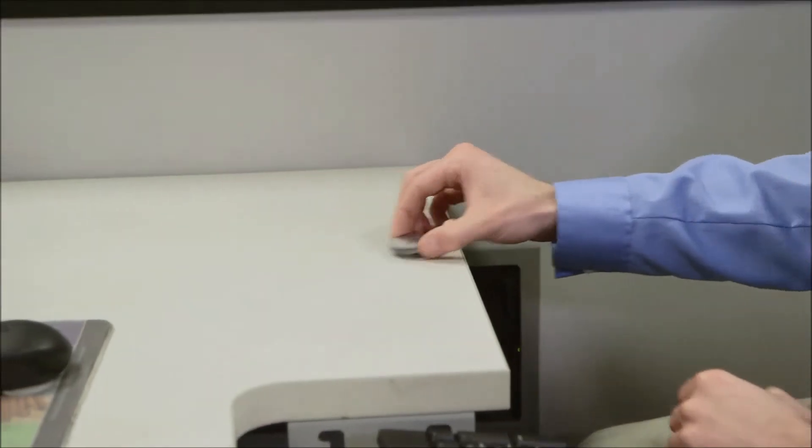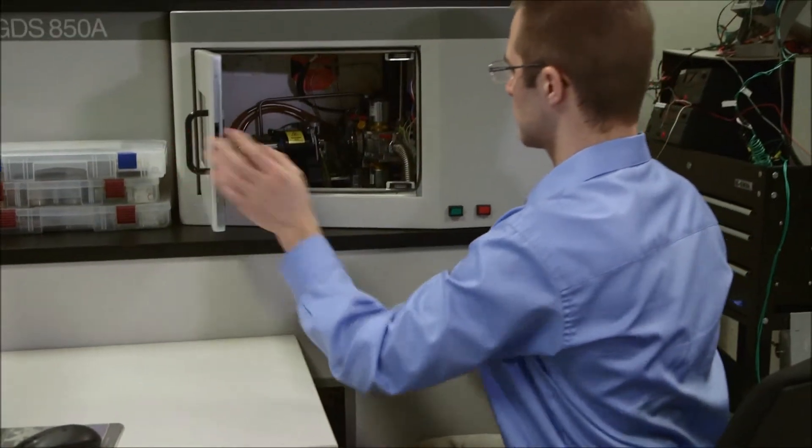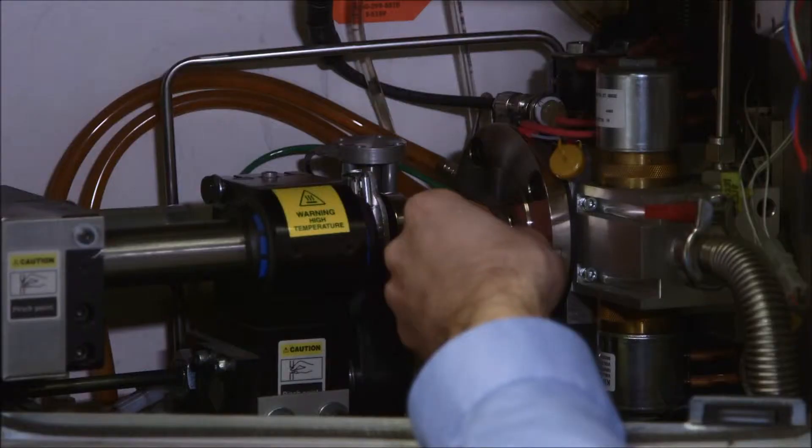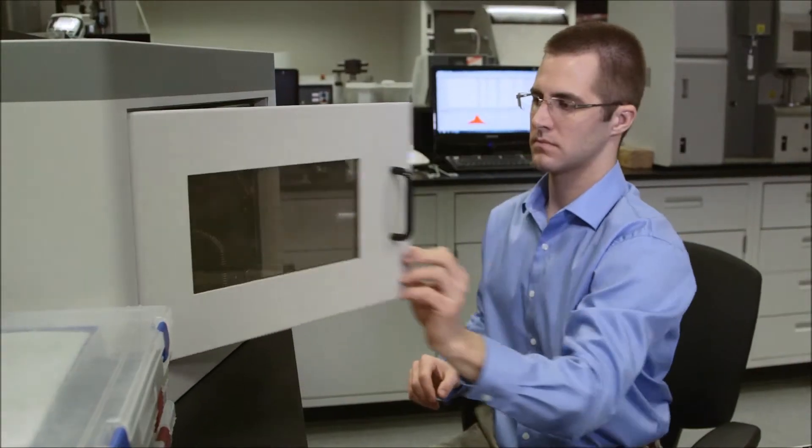Within the Fisher Barton Technology Center, we have multiple different methods of testing the chemical composition of our different materials that we're using on our products. One of these being our Leeko 850 glow discharge spectrometer. And what this spectrometer is capable of is testing the chemical composition on low alloy steels, tool steels, stainless steels, and also testing our nickel and tungsten carbide coatings. So what this allows us to do is we can take a small section out of any one of our components or out of a competitor component, and we can mount this within our machine. And in about five minutes, this will give us a full chemical composition of that material.